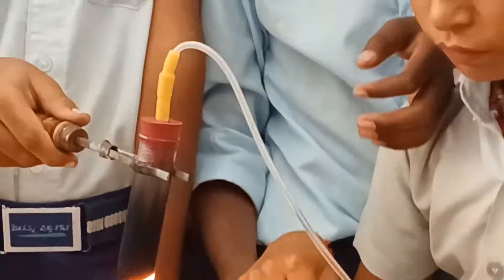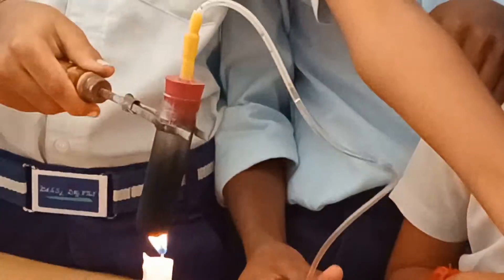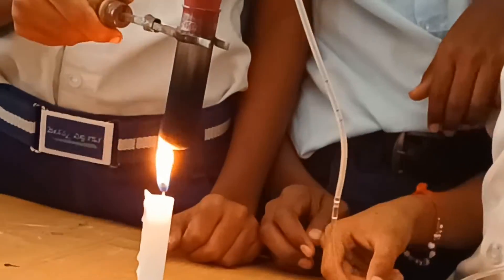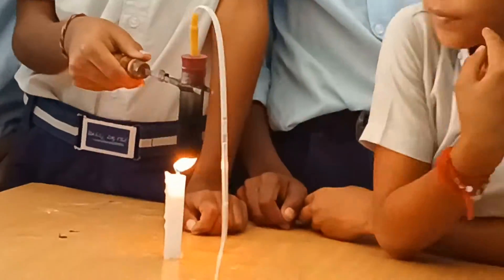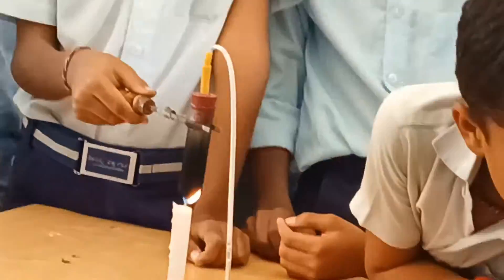After some time, water vapor goes into the second test tube through the delivery tube. The water vapor slowly turns into water. This water is called distilled water and it is free from impurities. Generally, impurities can be removed from water by distillation.